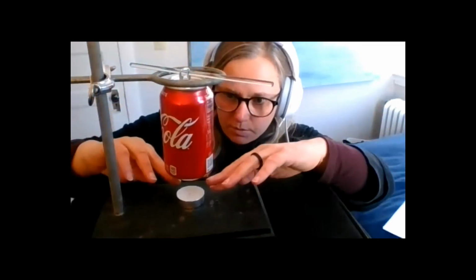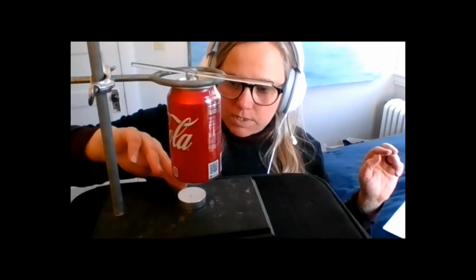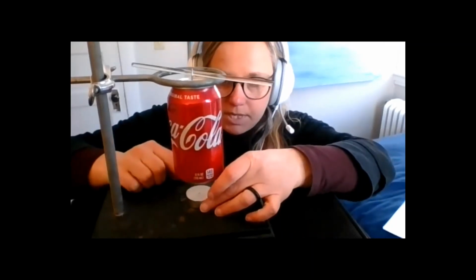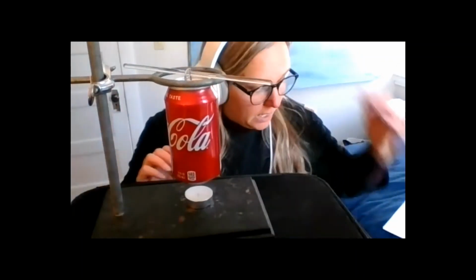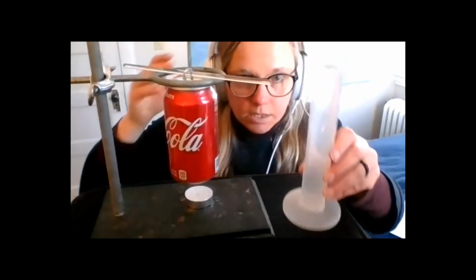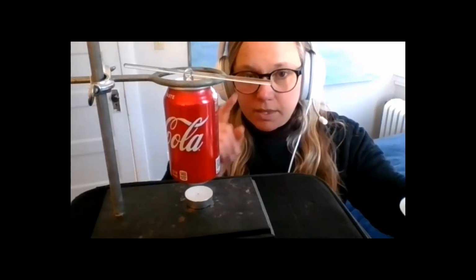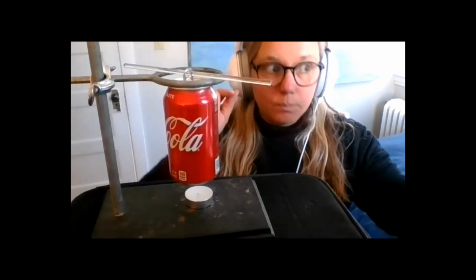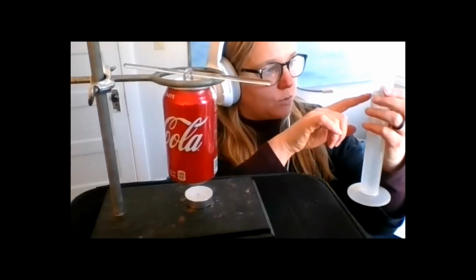So get it all set up so it's 2 centimeters. What did I say? 2 or 3? Anyway, 2 is good. 2 or 3 centimeters from the top of the candle to the bottom of the Coke can. Try to get that candle right underneath the can. Get it all set up, and then you're going to want to take your 100 milliliters of water, and you want to make sure you read that thing. You don't have to get it exactly 100.0, but you do need to read your scale.